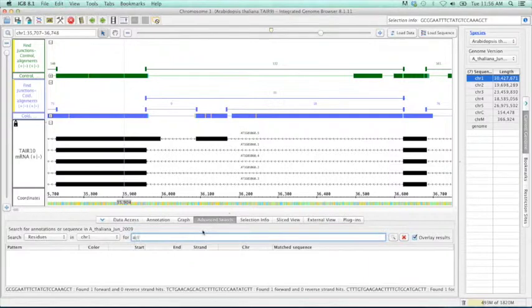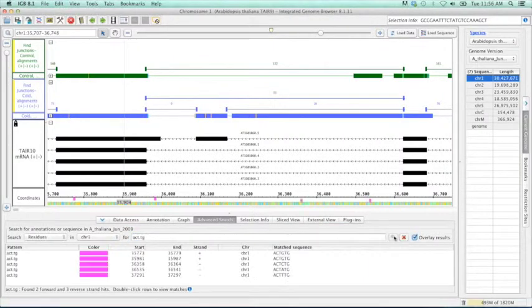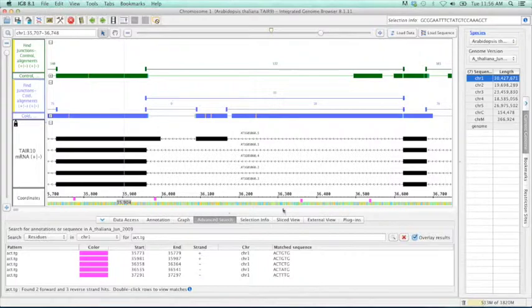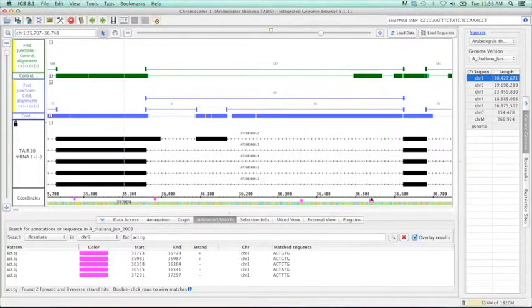So if we look at ACT, TG again. We search. Yes, so this one is on the minus strand. This one's on the minus strand. And then these two should be on the positive.